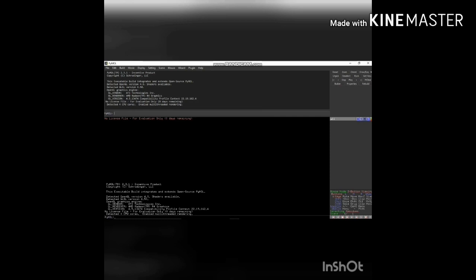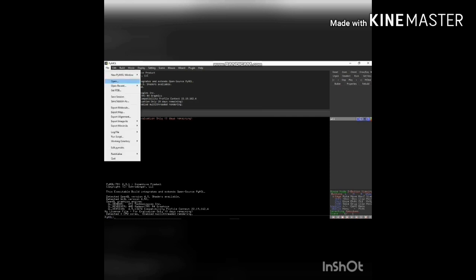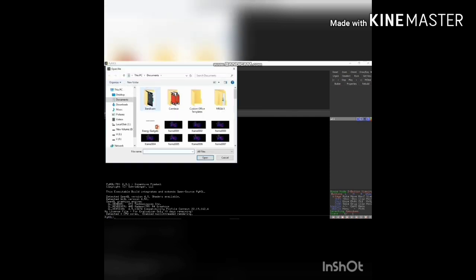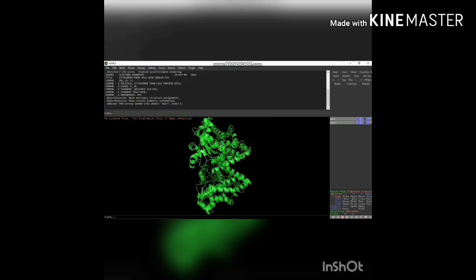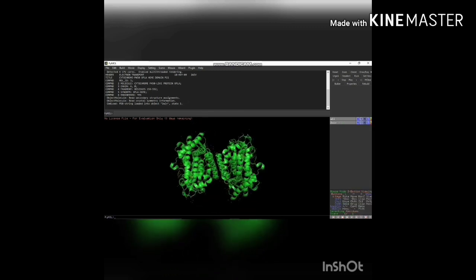Now go to PyMOL and open your PDB structure. Select the protein you downloaded, open it in PyMOL, and this is the cytochrome P450 enzyme, which is a family of enzymes containing heme as a cofactor that function as a monooxygenase. In the object menu panel, click active and give the orient command so the structure will be arranged properly.